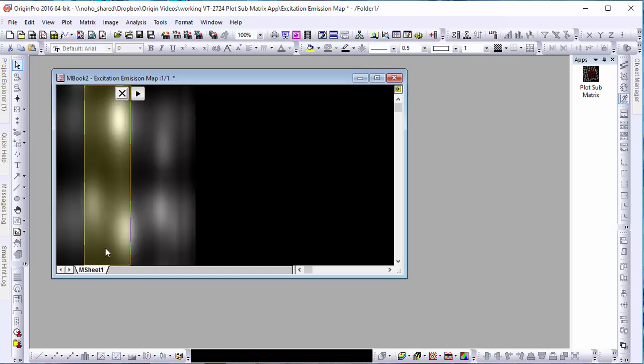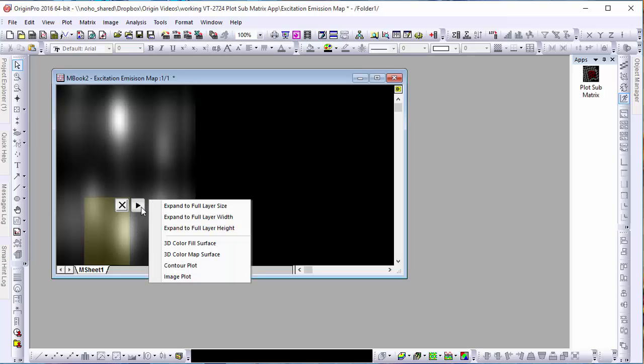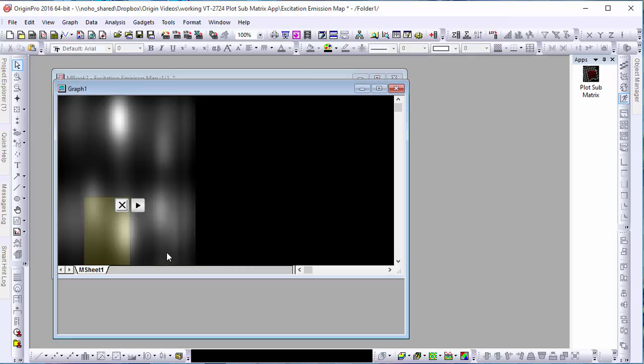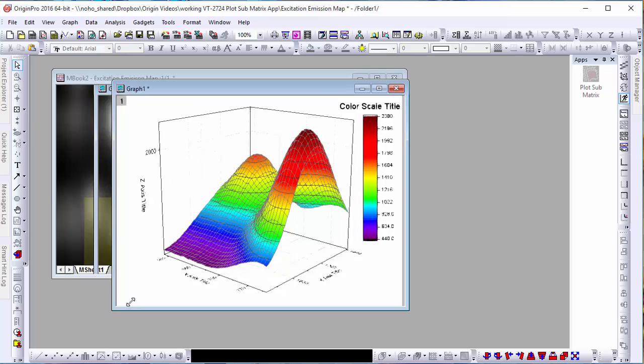Once we've adjusted these boundaries to the section of the matrix that we wish to plot, we can select the right facing arrow button and choose several ways of plotting our matrix. As you can see, our data has been plotted as a 3D color map surface.